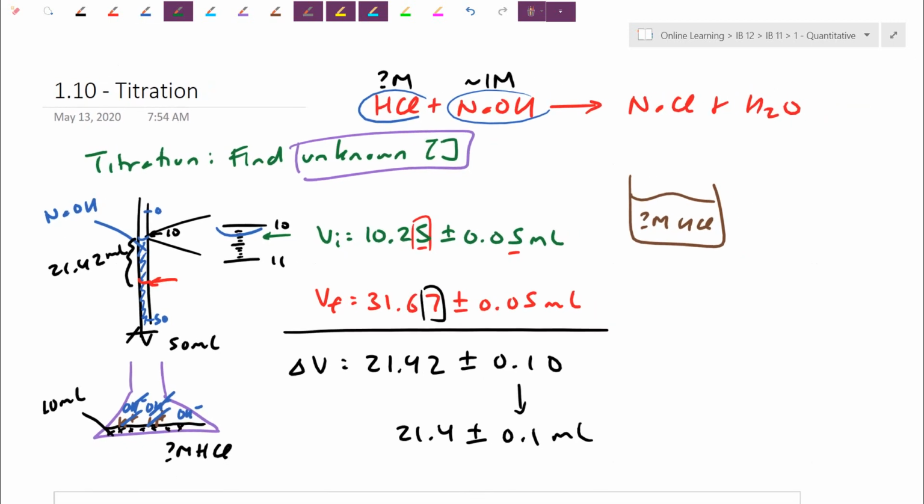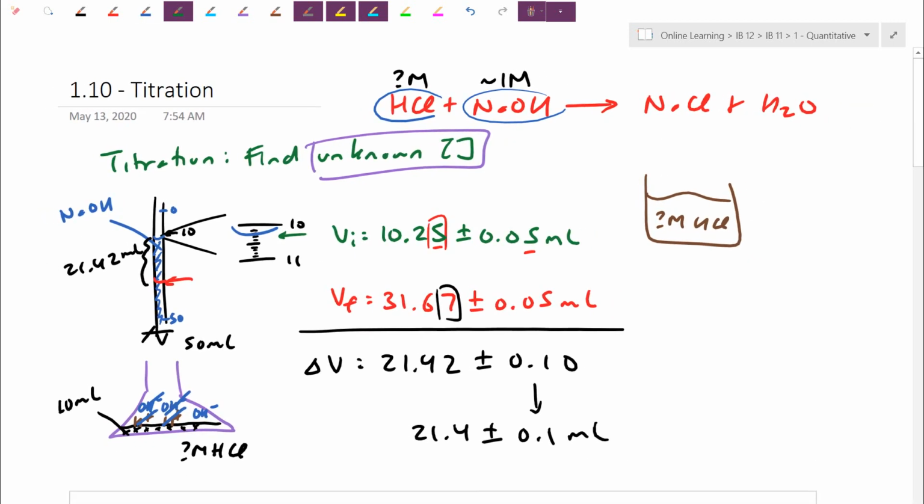Here's one other little problem: unfortunately, both HCl and NaOH are colorless solutions. Ideally, I want to be dropping in the base to kill off the H+, but seeing as everything is colorless, I wouldn't know when what's called the equivalence point is reached. Maybe I can introduce that term for you here. We're looking for it to hit the equivalence point. The equivalence point is when the moles of acid, moles of H+, equals the moles of OH-. That's the perfect stopping point where you actually have no excess.